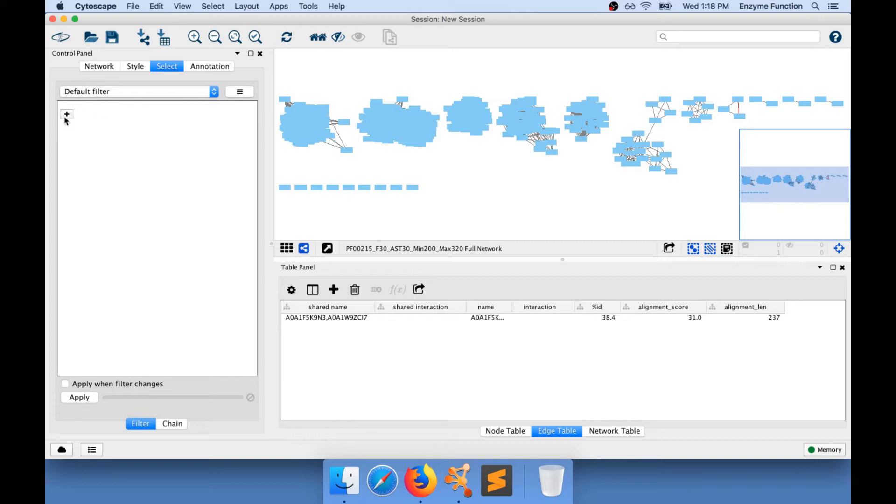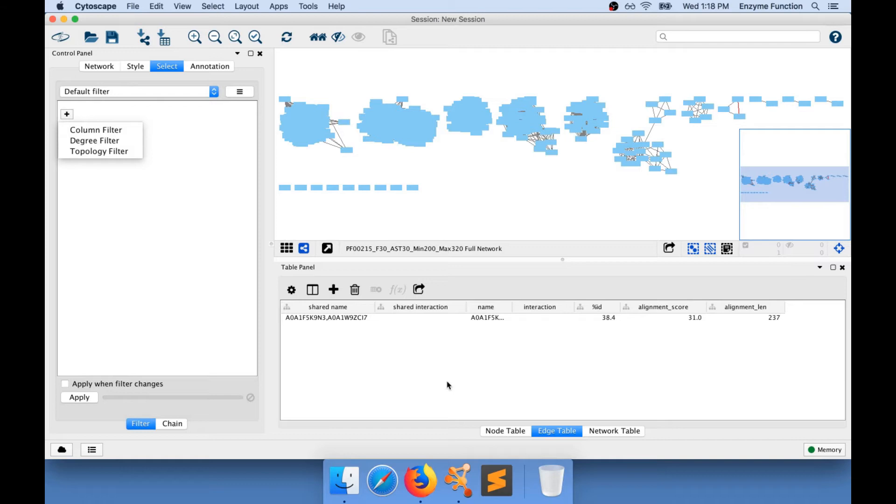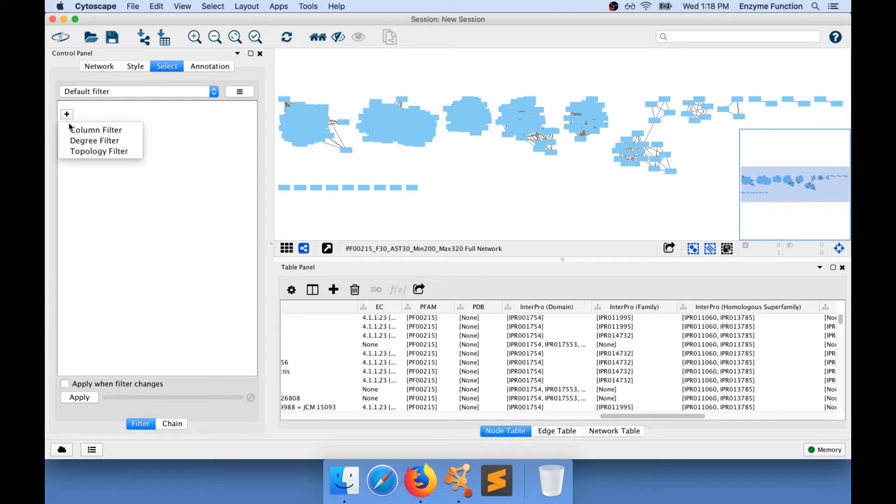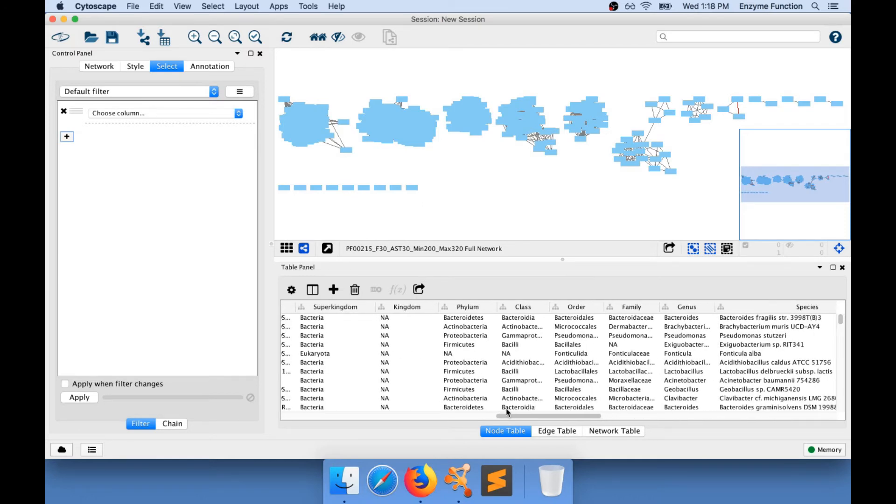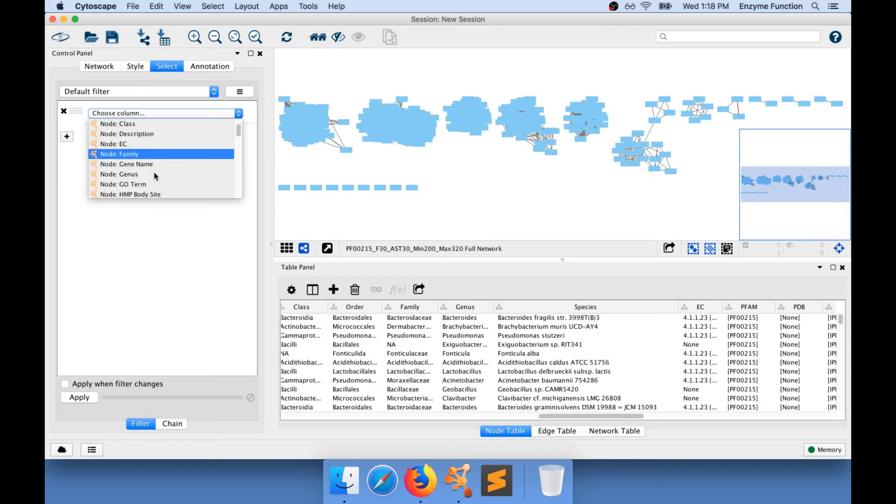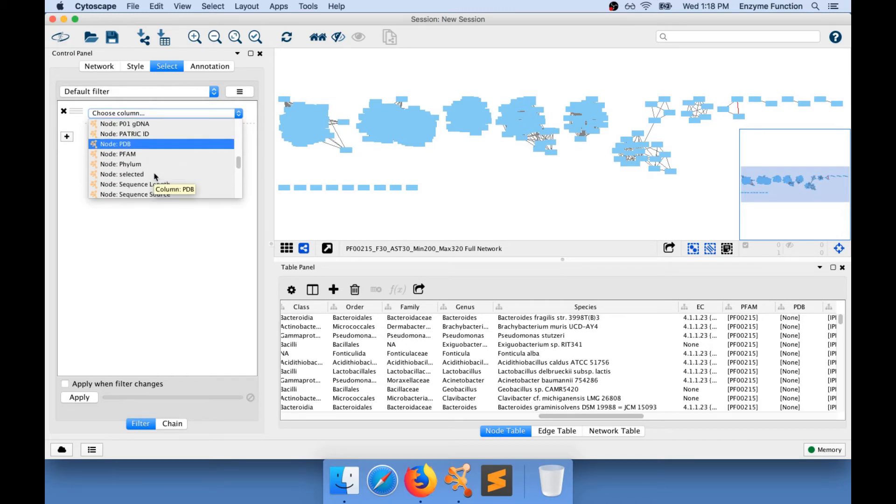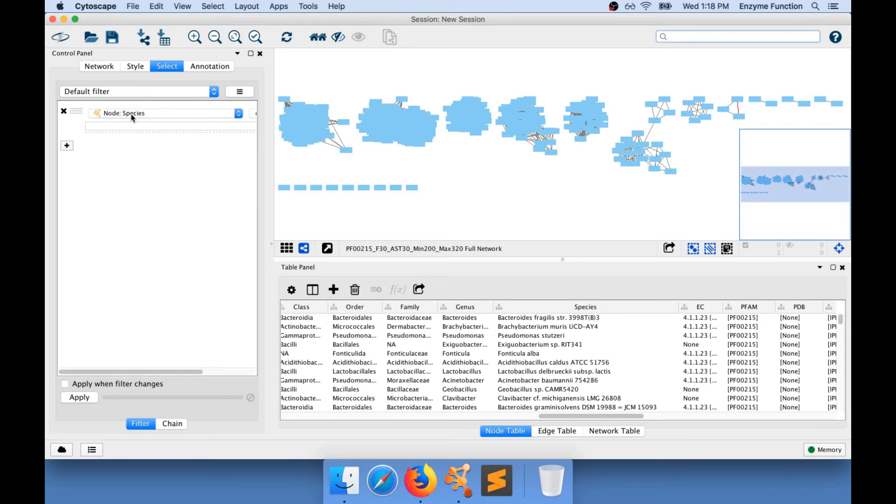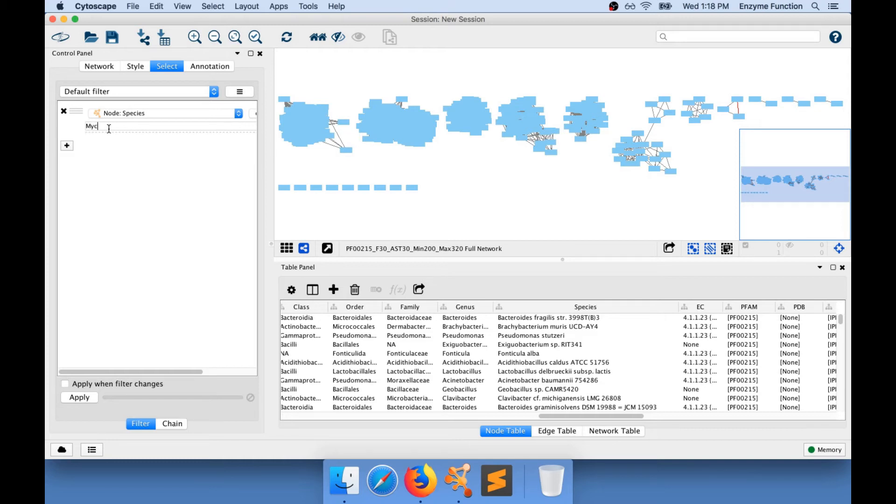For example, I am going to go and add a filter, and the filters that you are going to apply are going to work on these node attributes or edge attributes. If I go to select, add a column filter, and I am going to choose the column that is species, I am going to be able to select all the nodes for which a species name contains Mycobacterium.